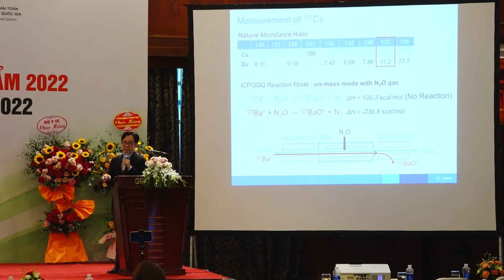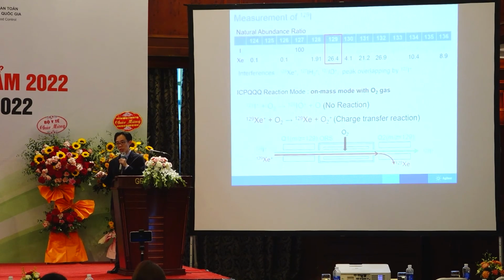There are additional examples which I will not go through, similar examples looking at different radioisotopes using triple quad technology.